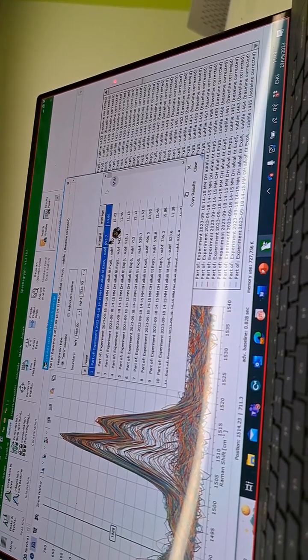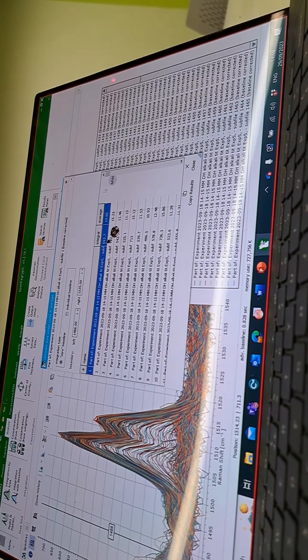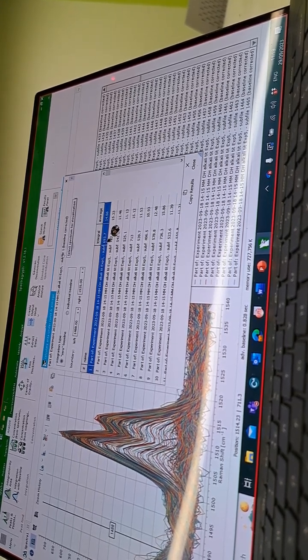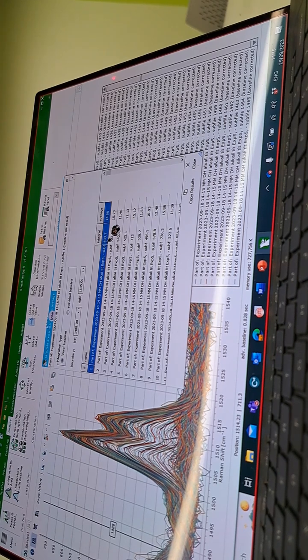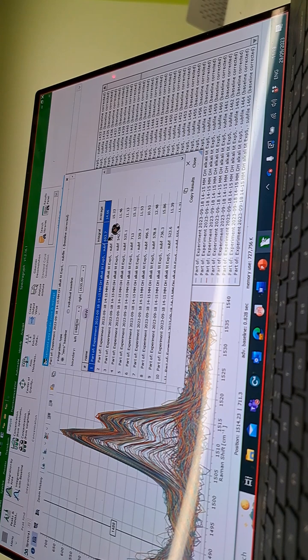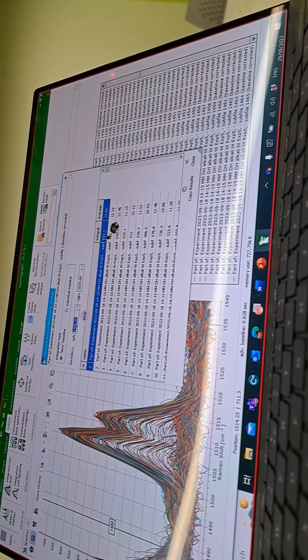But you need to find out what spectrum this is. Yes, yeah, yeah. It is subfile 1, except it's the original. Make this narrow. Okay.